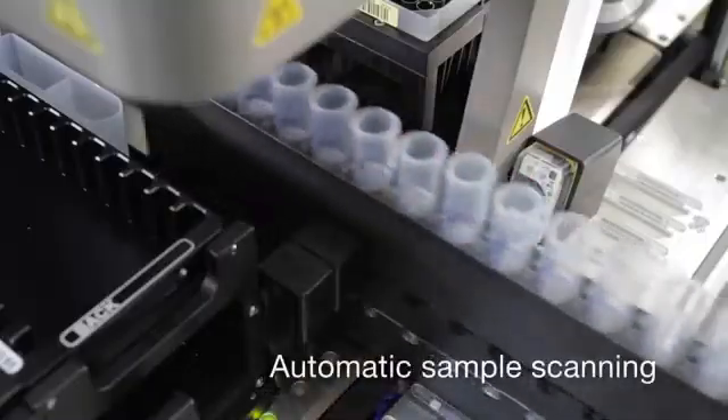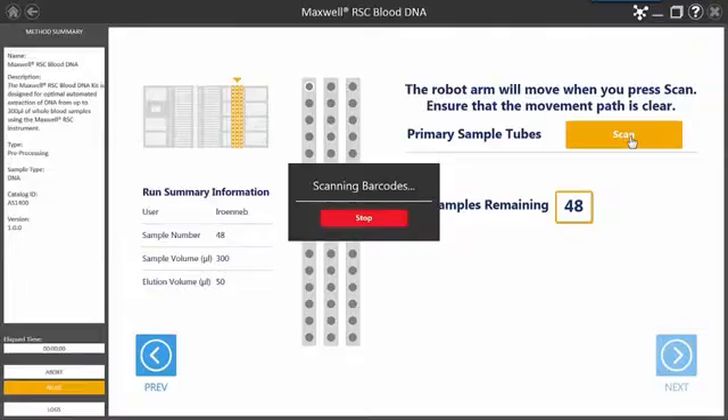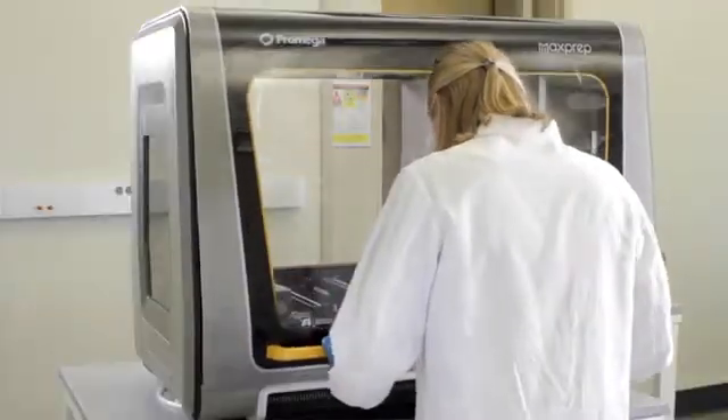Sample barcodes are automatically scanned as they are placed on the MaxPrep Liquid Handler. The portal software monitors and tracks the sample IDs as they move through the workflow.